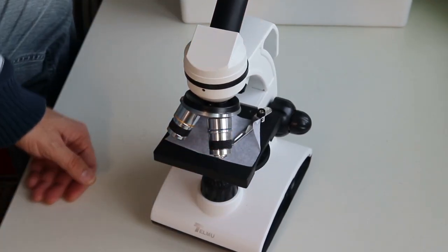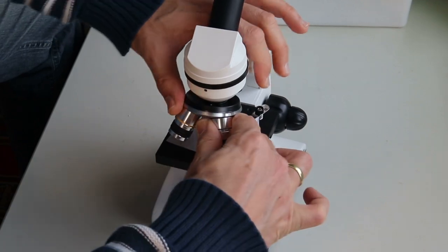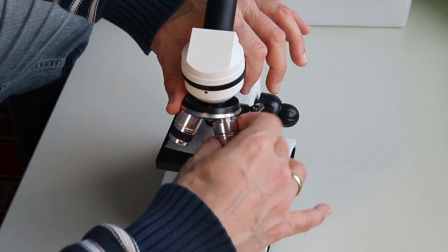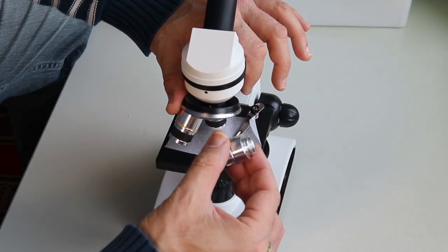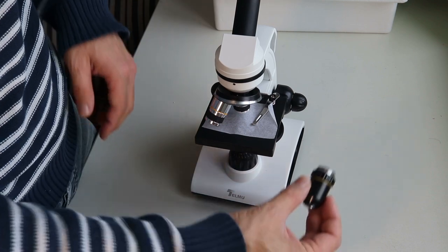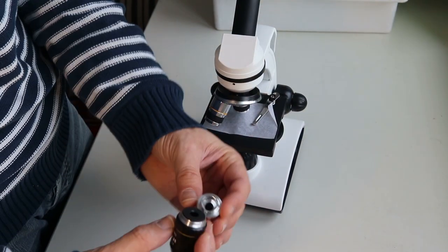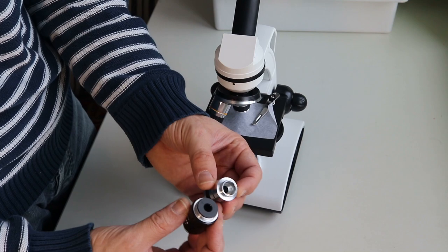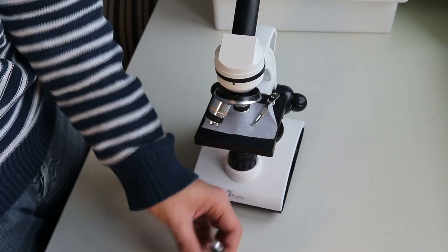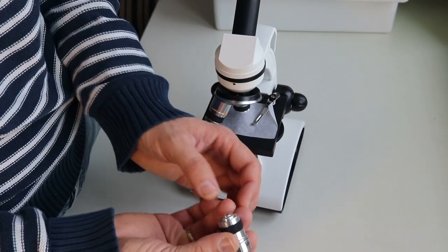They look relatively large. I do not know if they actually adhere to the 160 millimeter standard. So maybe it's possible to unscrew them and take one of them out, and then let's see if I'm able to fit in another microscope objective. So I have here a 100, this here is a 160 millimeter standard objective, and I think I can already see that they do not fit. So these are not standard objectives, okay? It's not possible for me to insert another one. Not a big problem, as long as they work fine, it should be fine.